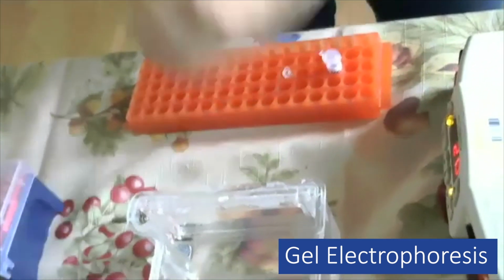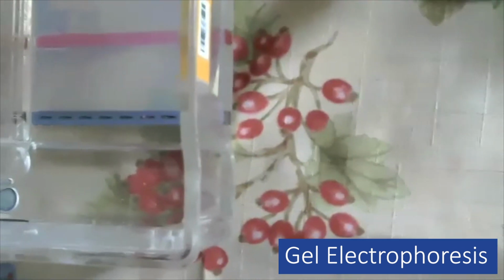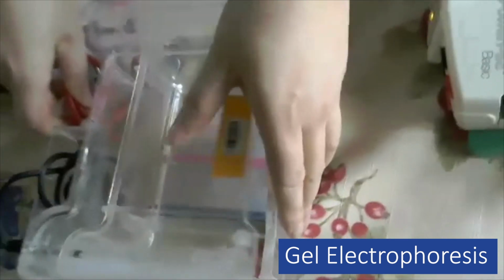The next sample should be from the tube you labeled D, right? That's the digested sample. All right, and again, you load 10 microliters and put it into the well. Okay, then that's all. You finish loading the gel, and then you just need to put the gel box together.